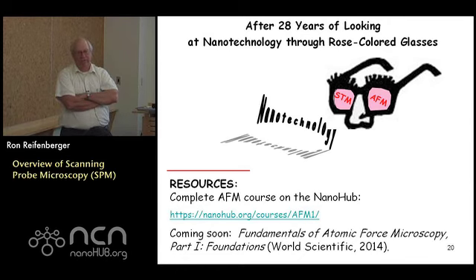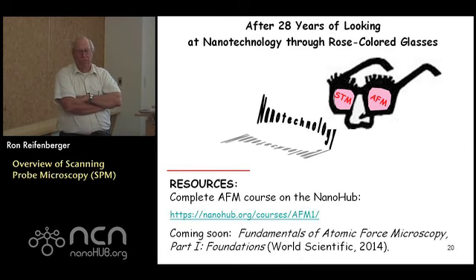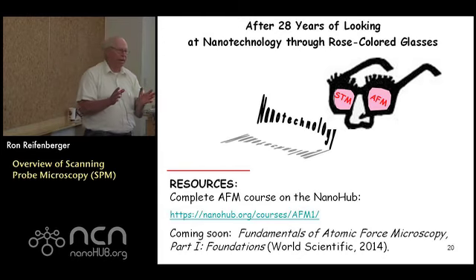It's a cottage industry, right? Now the trouble is physicists aren't very good at chemistry. So what we tend to do is establish collaborations with chemists who know how to coat the tips with molecules, right? Physicists aren't very good at depositing thin films. So we tend to collaborate with people from, let's say, the clean room who might know how to deposit thin films, right? And so that's one aspect of this microscope that I didn't mention.